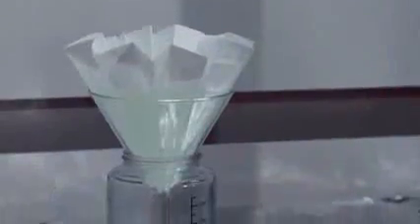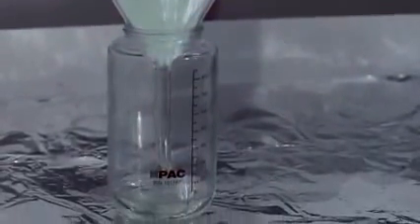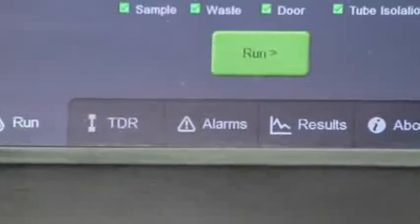To get started you'll filter the jet fuel directly into the sample container. This process hasn't changed from the JFTOT 3. Make sure you perform this step in a laboratory hood. While the fuel is being filtered, select Run from the home page.